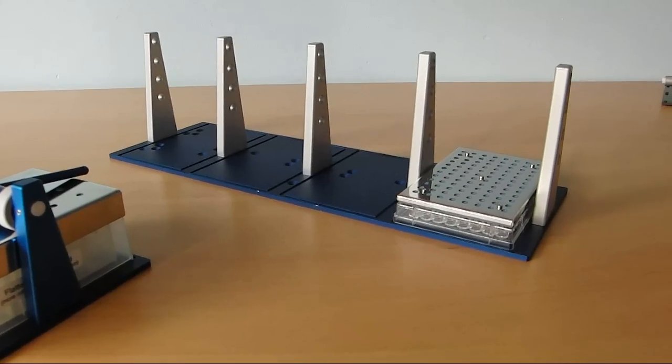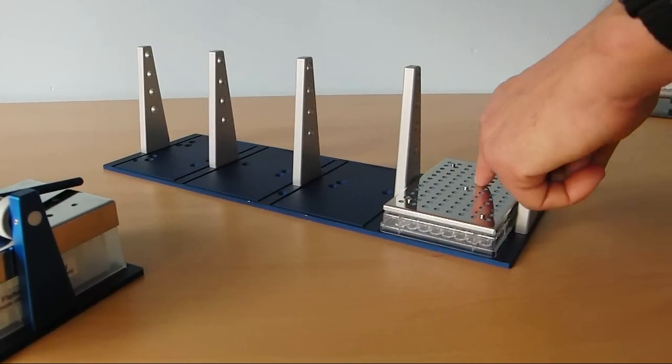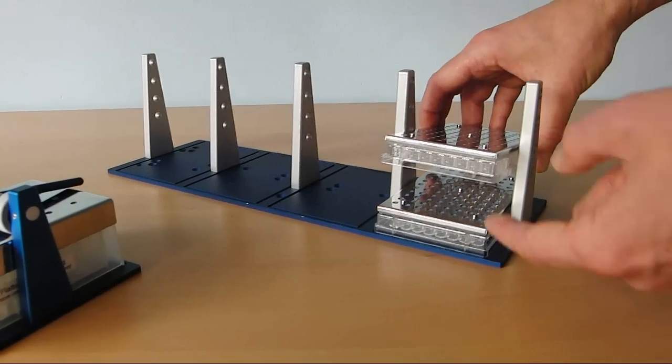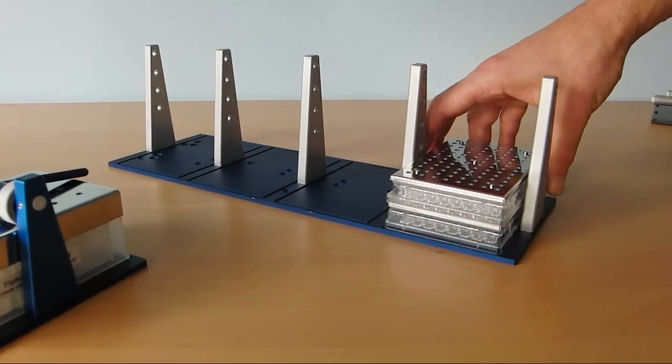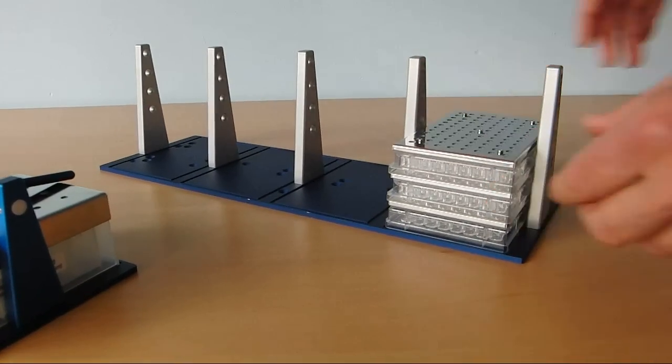For this purpose, all sandwich covers for low well plates have spacers, as shown here. This allows you to stack the next microtiter plate on top and still have a layer of air in between. In this way, aeration rates and evaporation rates remain equal in all wells.